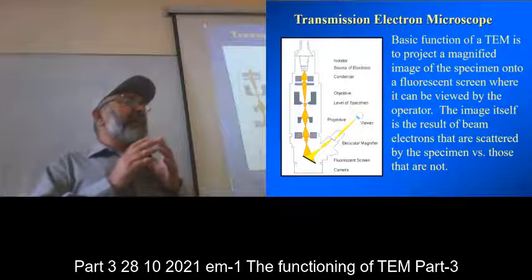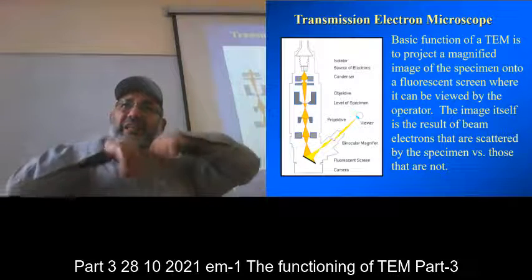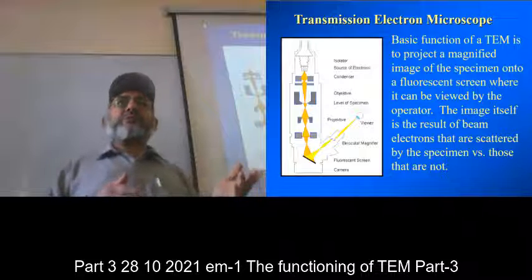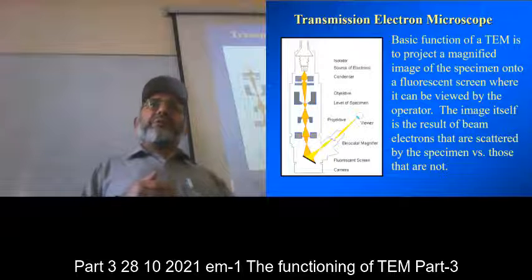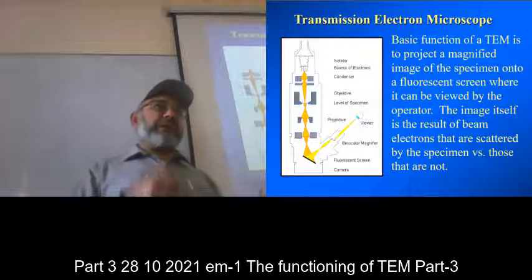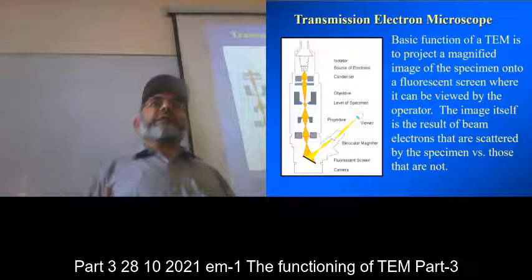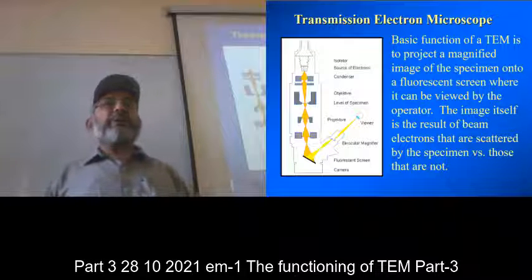The viewing screen, it is a full screen at the bottom. You have visited the lab. I have shown you those who visited, right? And those who didn't visit, come to my office collectively, and I will give you a brief tour to see what is practically available there. But I took the previous students and I showed them in detail how the electron microscopes are working and how they look like.